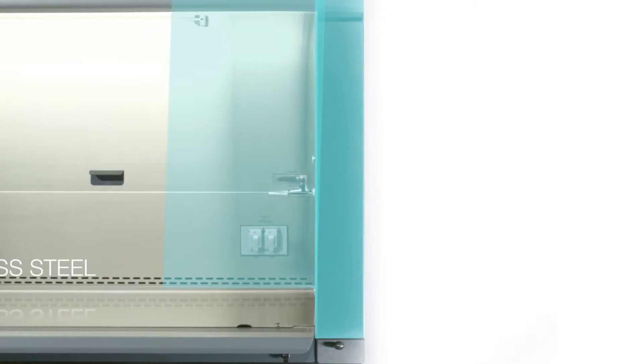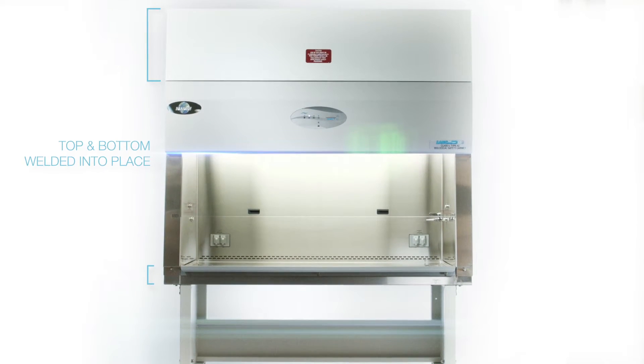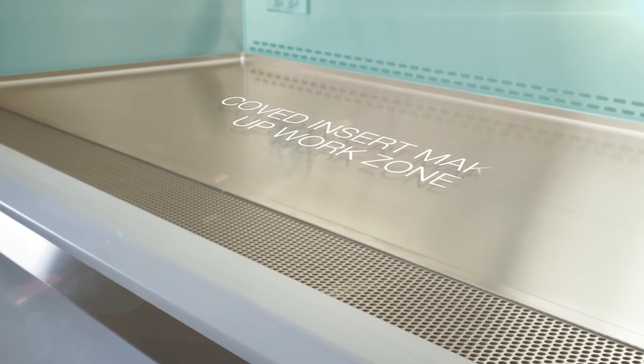A single sheet of stainless steel makes up the walls of the cabinet. The top and bottom of the unit are welded into place, and a coved insert makes up the work zone.